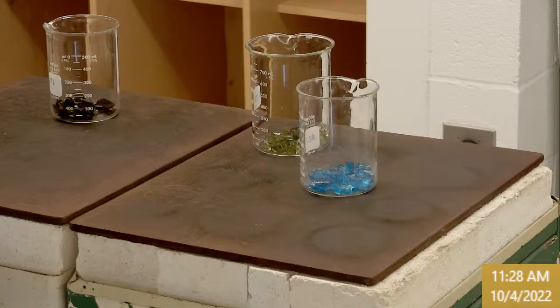Dr. Reed, what's the ion observation again? So the spreadsheet that is posted shows the metal ion, which is like iron 3+, or copper 2+, or chrome 3+. And the spreadsheet calculates the batch weight and the metal concentration. And usually it's between 0.1 and 0.5. It's at the far left side of that calculated spreadsheet. I actually posted it as an ion. That's also then your ion concentration.